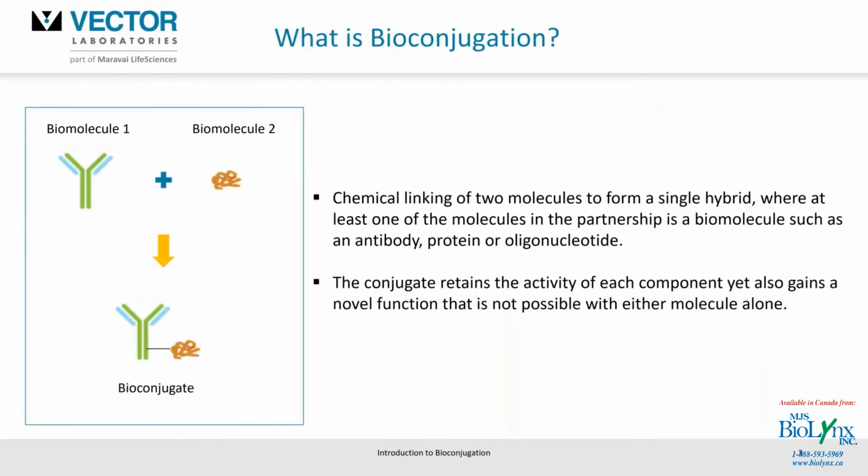All right, so let's dig right into it here. What is bioconjugation? And the image I've got here on the left-hand side is probably the easiest one to talk from or visualize at your end. So I've got a molecule over here, a biomolecule that looks suspiciously like an antibody, and you want to conjugate this squiggly line to it. Let's just call this squiggly material peroxidase or horseradish peroxidase.